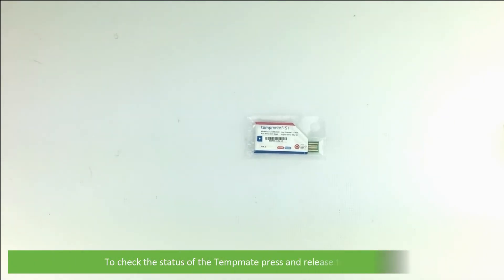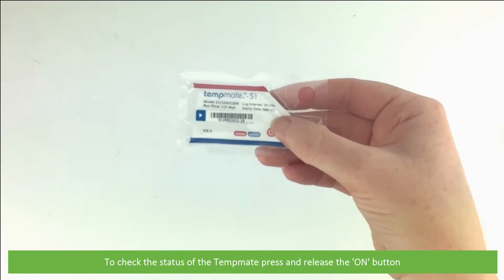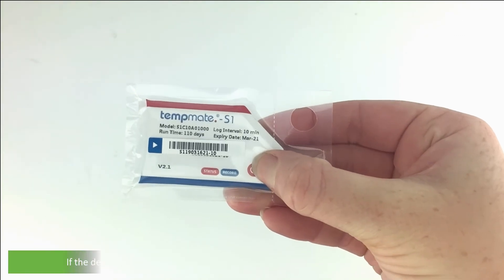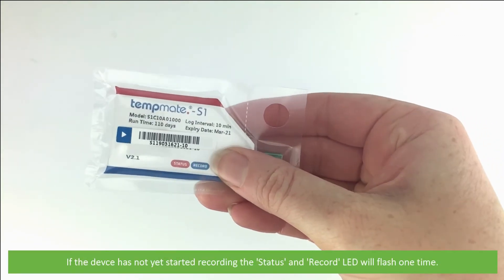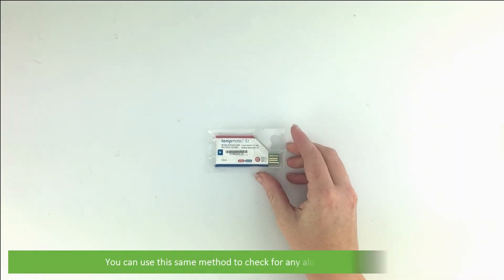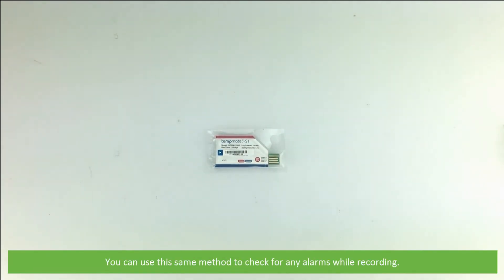To check the status of the TempMate, press and release the on button. If the device has not yet started recording, the status and record LED will flash one time. You can use this same method to check for any alarms whilst recording.